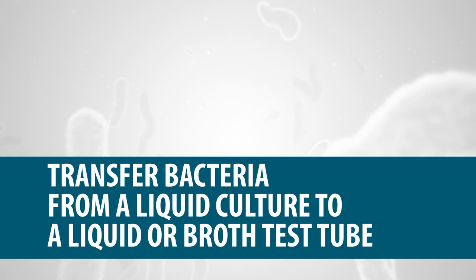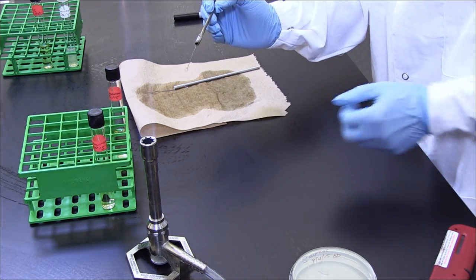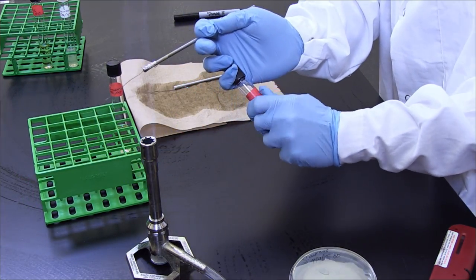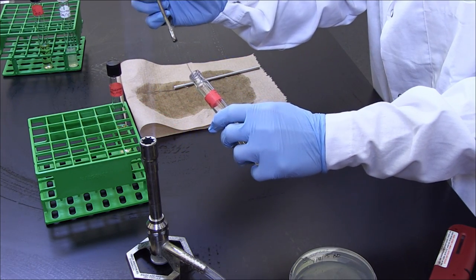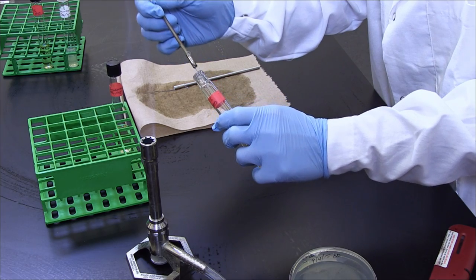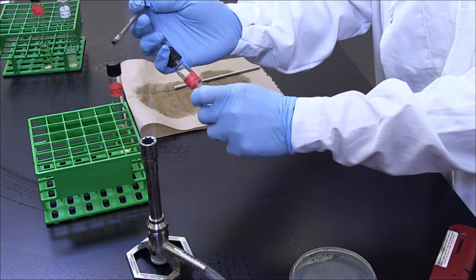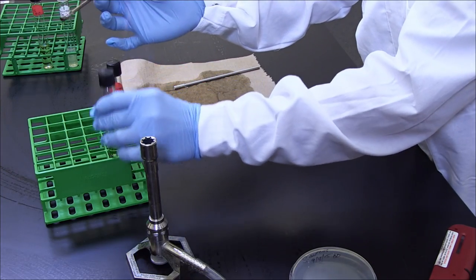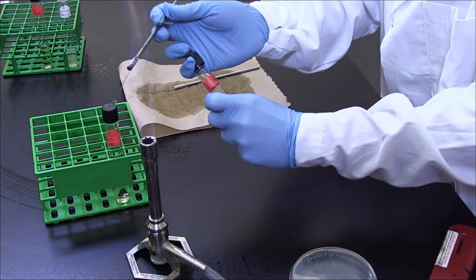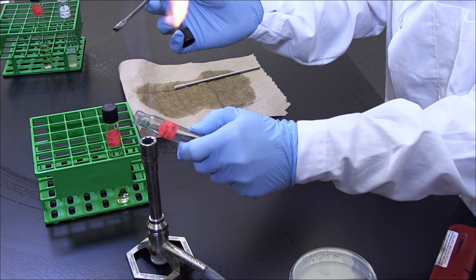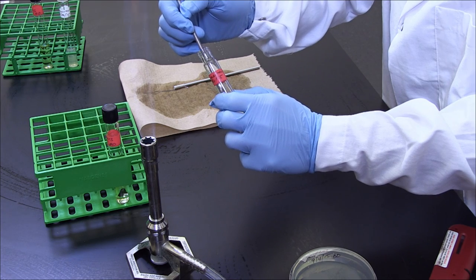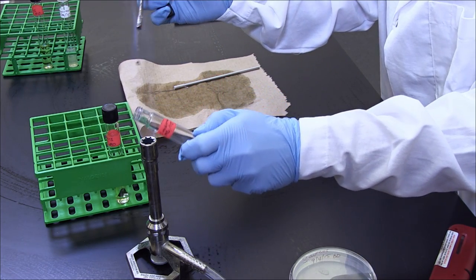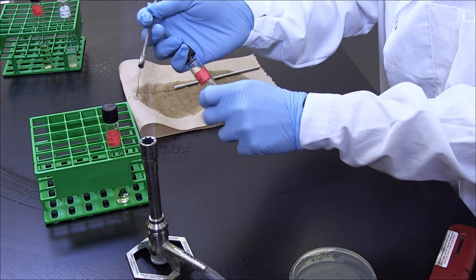Transfer Bacteria from a Liquid Culture to a Liquid or Broth Test Tube. Sterilize the inoculating tool, take the cap off the test tube of liquid culture, and pass its mouth through the flame several times. The inoculating tool is then dipped into the liquid culture and removed. Sterilize the mouth before replacing the cap. Pick up a test tube with liquid medium with your free hand and remove the lid with your dominant hand. Pass the mouth of the test tube through the flame several times to sterilize. The inoculating tool with bacteria is then dipped into the liquid. Sterilize the mouth of the test tube again before replacing the cap.